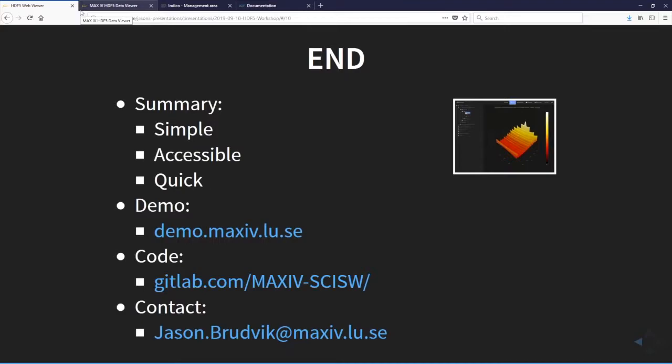That's the first way. And the second way is because it's written in Python, you can do the same from Python. Either from one function call, or you can open your SPEC file, for example, as a file object, and we provide an h5py-like API on top of it. So you can use it as if it was an HDF5 file. And there you can either save everything and write it as an HDF5 file, or you can select what you want to do with it. You have more control on what to do for the conversion. So that's it for the first part, conversion.